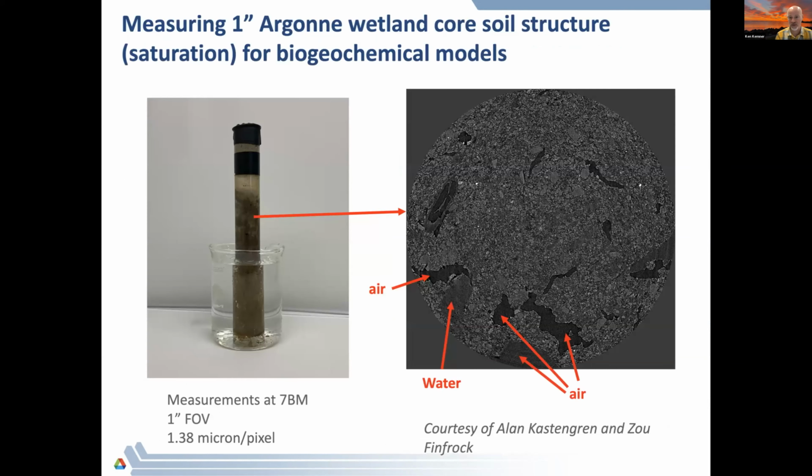In addition to the chemistry, we're also trying to incorporate the understanding again of the physics and the porosities and the movement of the hydrology within these cores. And so a simple demonstration we did was to take a soil, first one was a 1-inch soil core that was collected, putting it just in a beaker of water, very simplistically at a particular height, with the bottom of the soil core open at this point, so that the water levels were going to equilibrate over a period of a few weeks in this soil core.